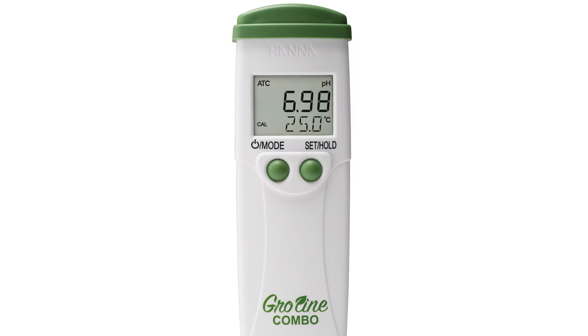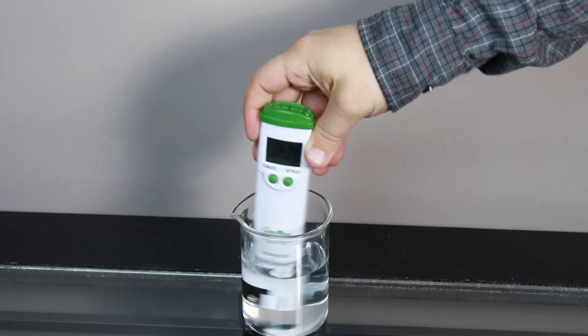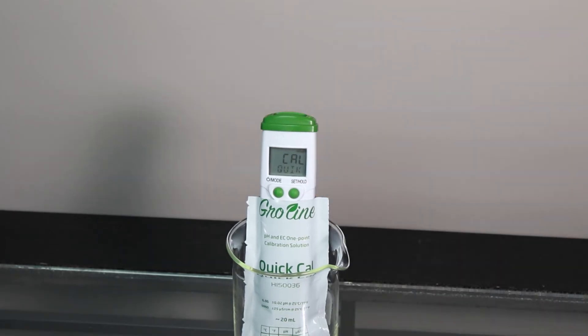To calibrate your meter, press the mode button for three seconds until Cal is displayed. If your tester is in the Cal Quick setting, first rinse the probe in distilled or deionized water. Place the electrode in your GroLine quick calibration solution and wait for a stable reading. Once stable, the tester automatically goes back to measurement mode.